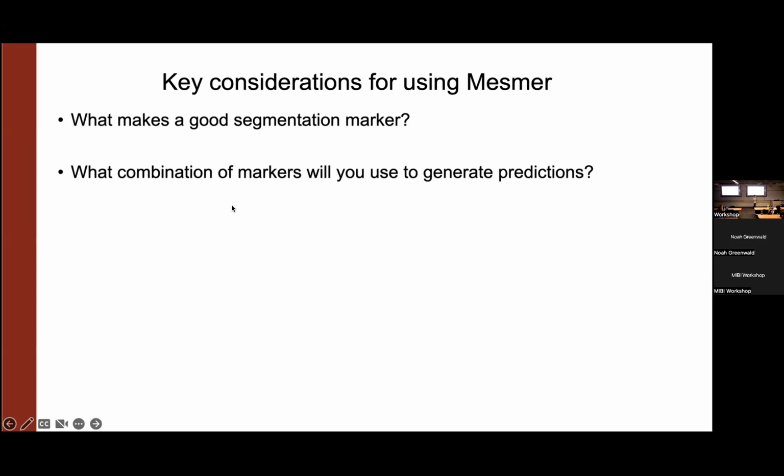A key consideration is that you don't want to just add every single marker together in your panel. You're like, well, this sometimes is a membrane marker, let me just throw it in there. The result is going to be that when it's not a good membrane marker and it just stains everything, it's going to decrease the signal to noise of that summed channel. And so you're kind of striking a balance between having as many cells as possible represented with a membrane stain without diluting the contrast between the membrane and the rest of the cell.